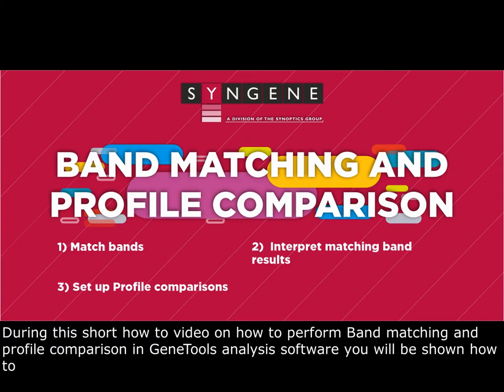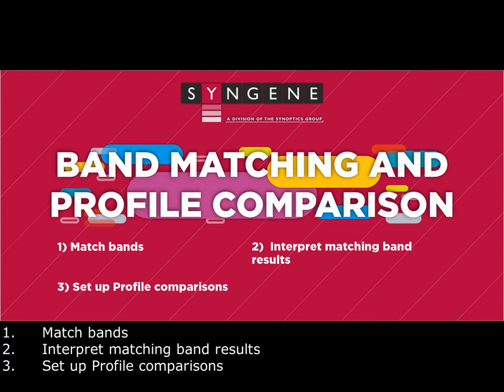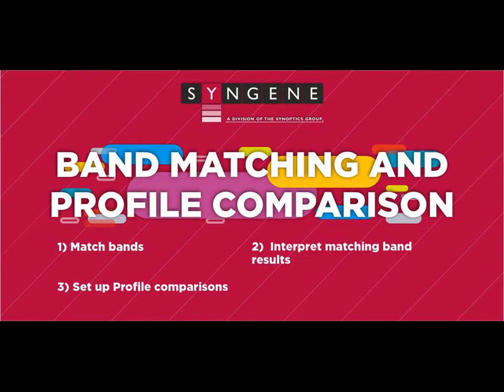During this short how-to video on how to perform band matching and profile comparison in GeneTools analysis software, you will be shown how to: 1. Match bands, 2. Interpret matching band results, and 3. Set up profile comparisons.